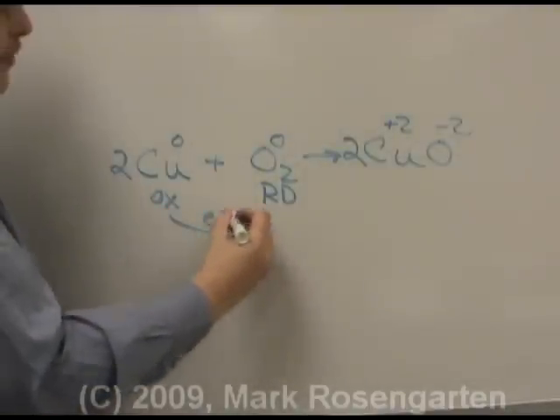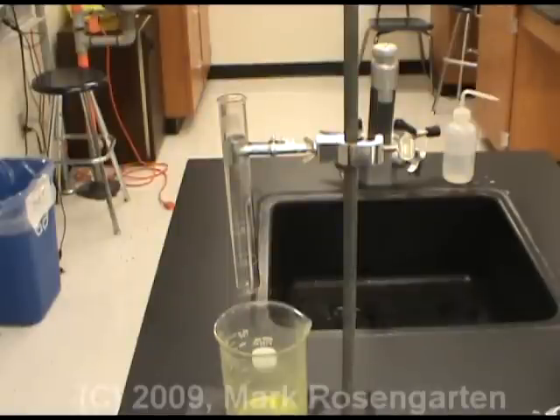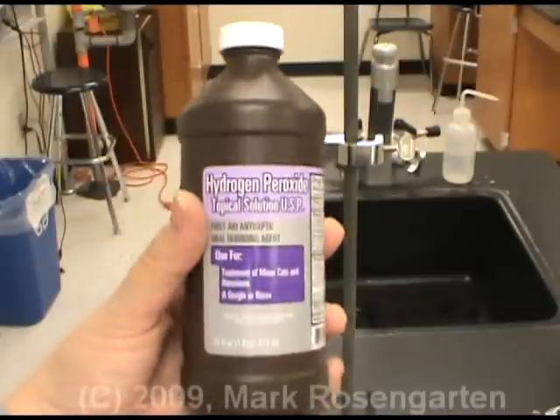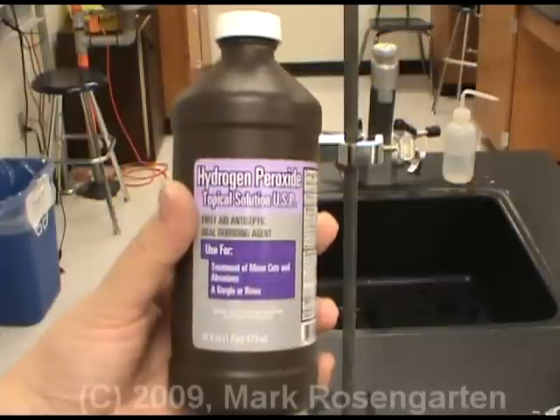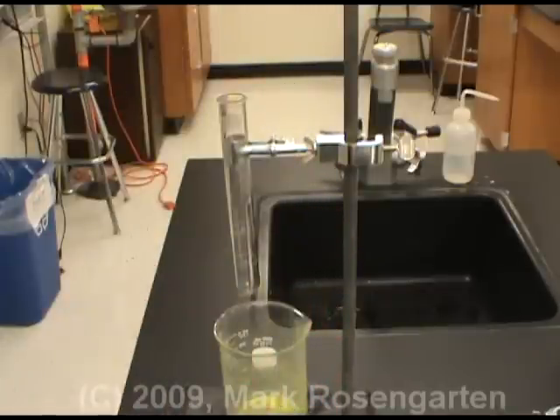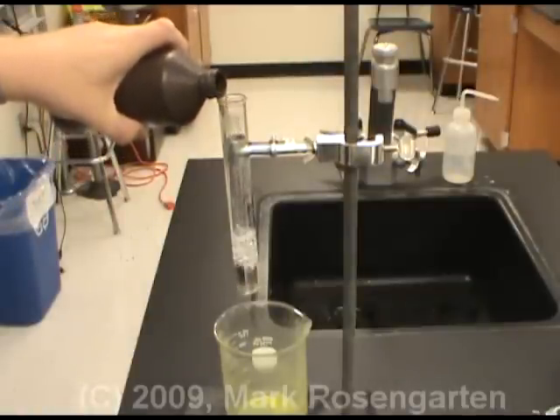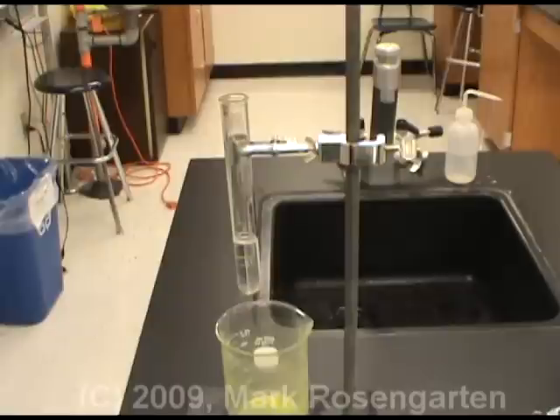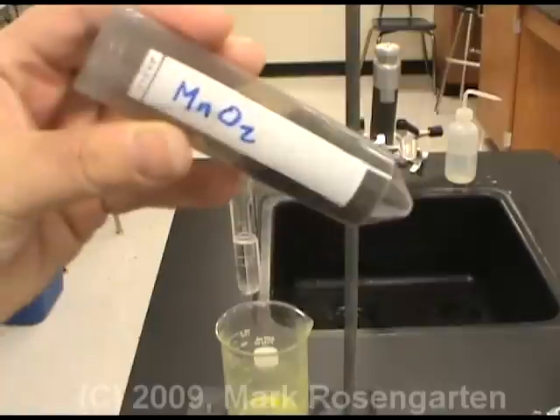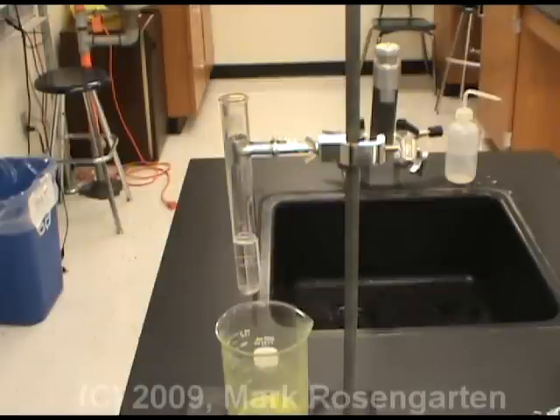The copper gave up its valence electrons to the oxygen. In this next reaction, we are going to decompose hydrogen peroxide. Peroxides are very unstable compounds and decompose very quickly when a catalyst is added. The catalyst we will use for the decomposition of hydrogen peroxide is manganese dioxide. When hydrogen peroxide decomposes, it forms water plus oxygen gas.